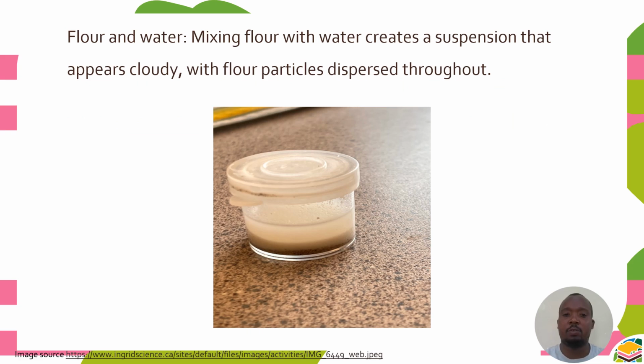Then we also have a mixture of flour and water. Mixing flour with water creates a suspension as well that appears cloudy. Remember, on the appearance, we said usually it is murky or cloudy. As you can see, it is cloudy with flour particles dispersed throughout. No wonder the mixture is looking cloudy. So indeed, on the appearance, it is cloudy.